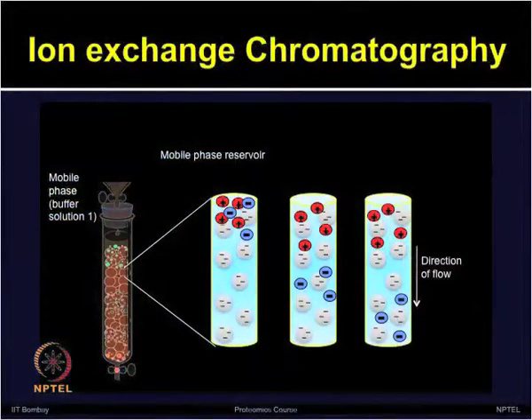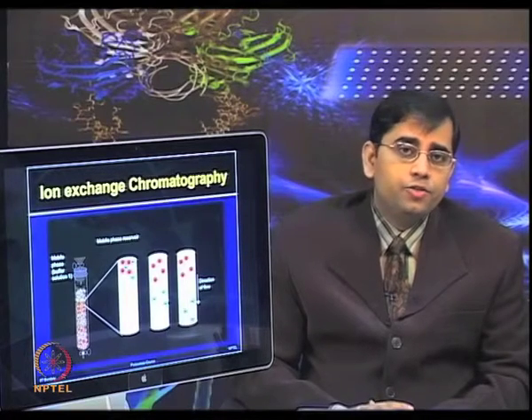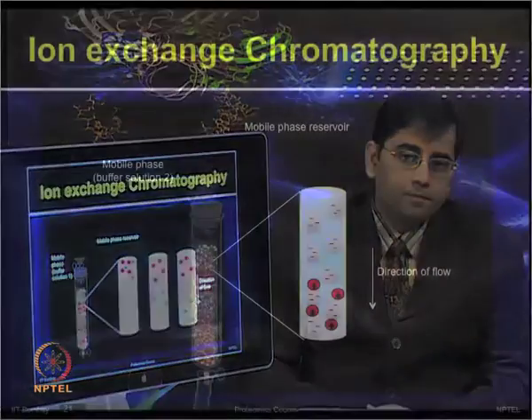Proteins are adsorbed to the ion exchange column and then can be desorbed by increasing the salt or altering the pH of the buffer, which can change the charge on the protein. Various anionic buffers such as acetate and phosphate are used for cation exchange, and cationic buffers such as Tris chloride or ethanolamine are used for anion exchange.